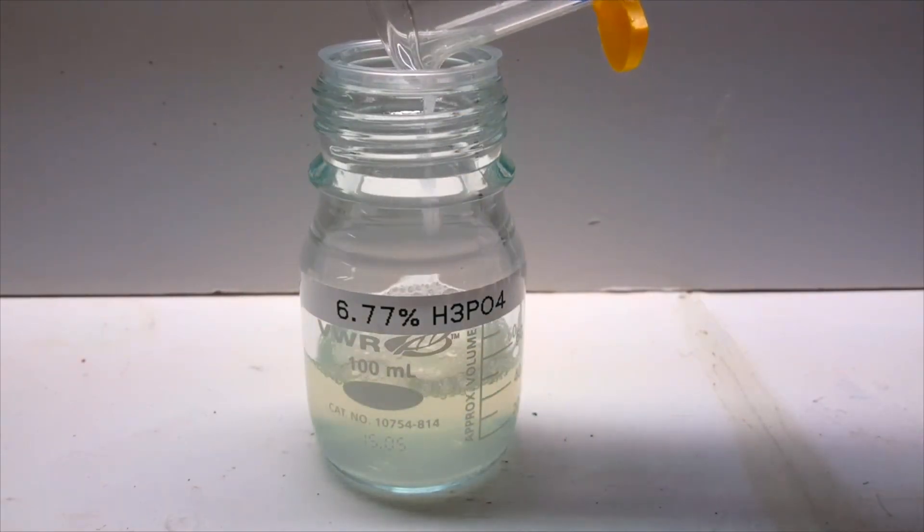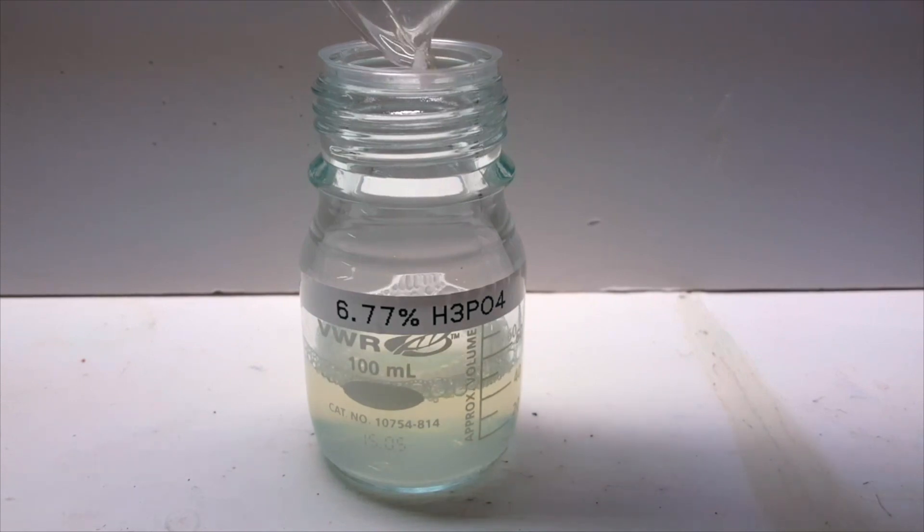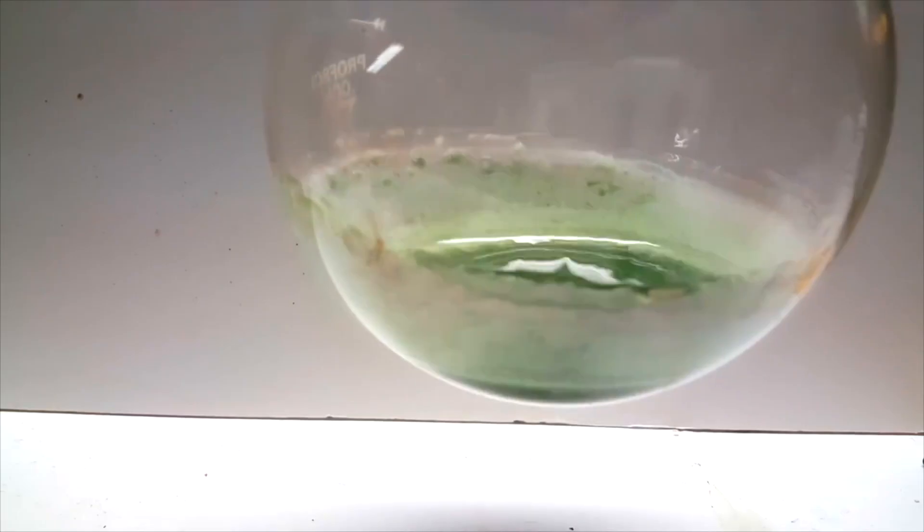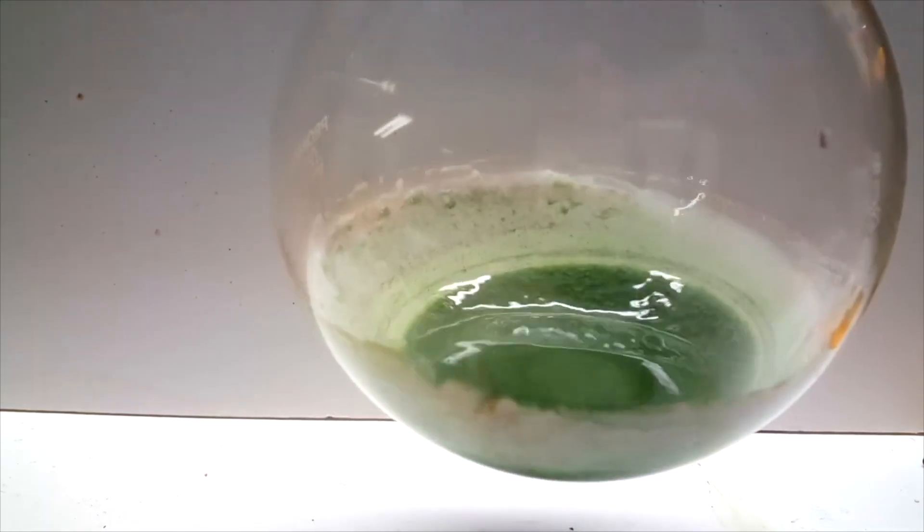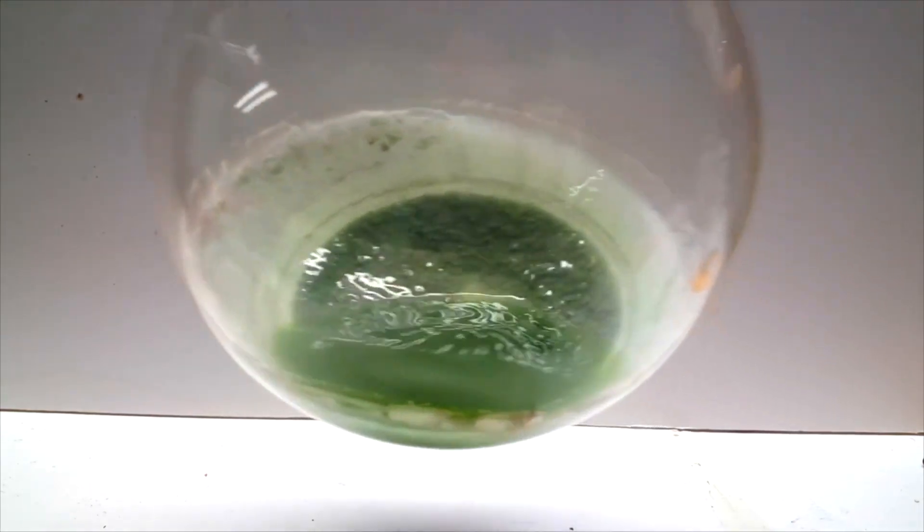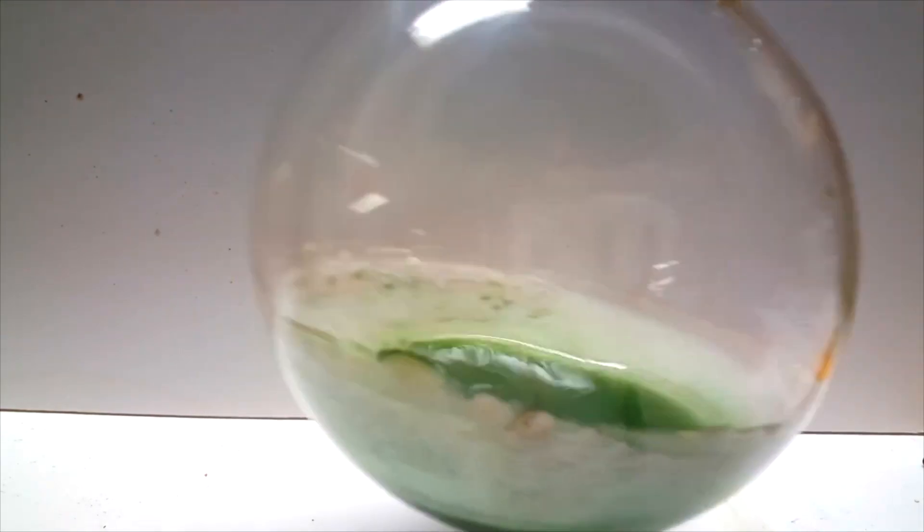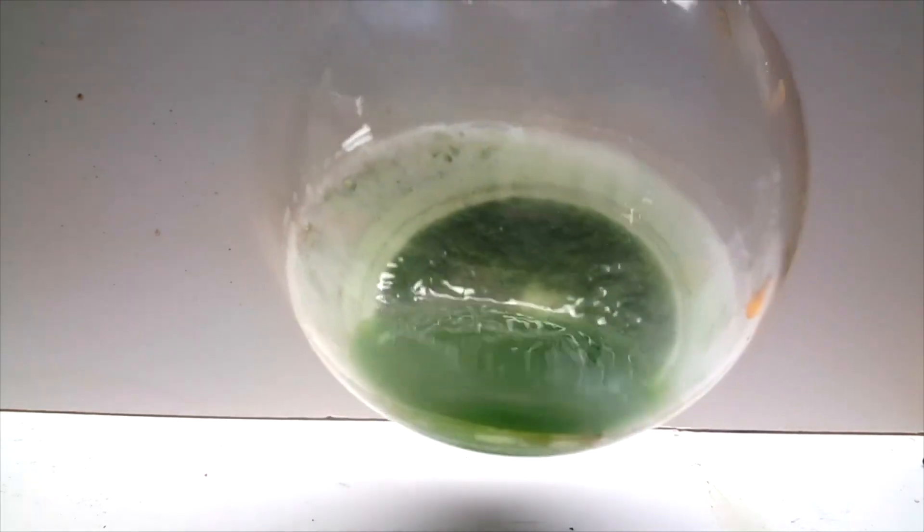The yield was pretty terrible, with only 47ml of a cloudy 6.77% acid collected. I saved the green liquid left in the distilling flask from the last run, so I decided I would try to improve my methods from last time to get a better yield.